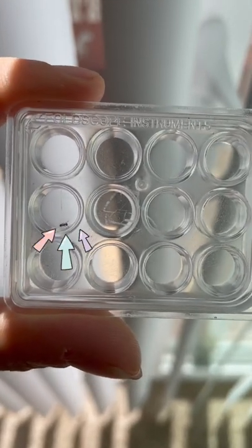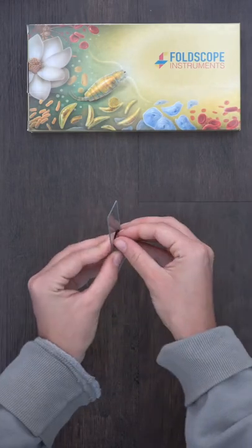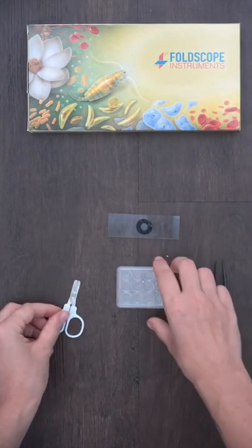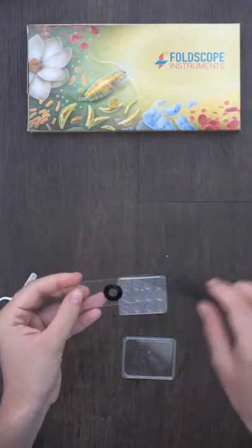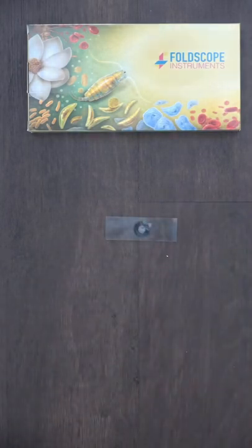Come take a closer look with me at this little ant underneath the Foldscope. To mount your sample, take your glass slide and put a ring sticker on it, saving the top part for later. To mount your ant on the slide, you're going to use a tool or tools and gently place the ant in the middle of the ring sticker, and place the clear sticker back on that you took off earlier.